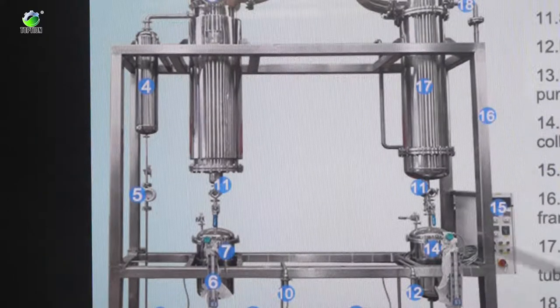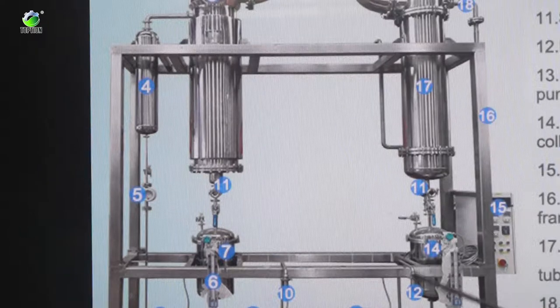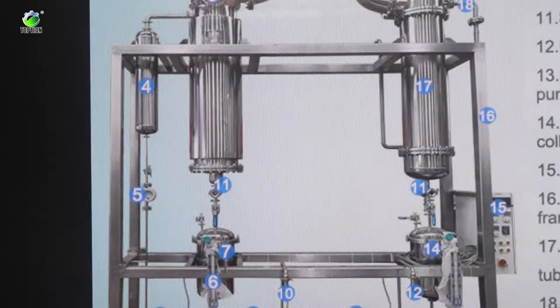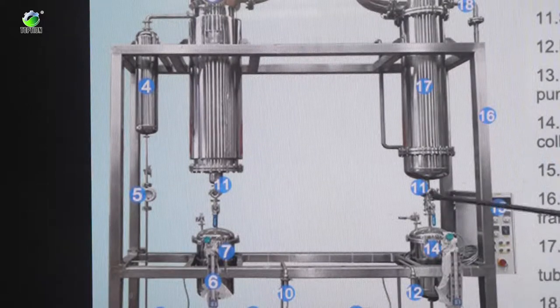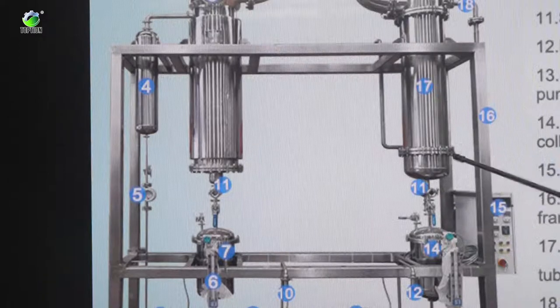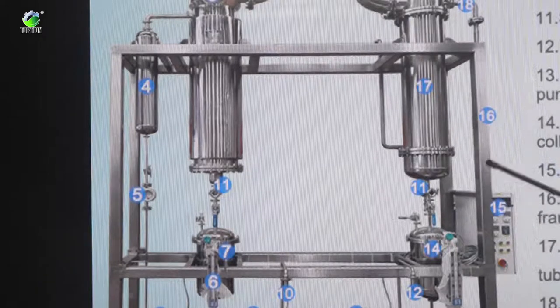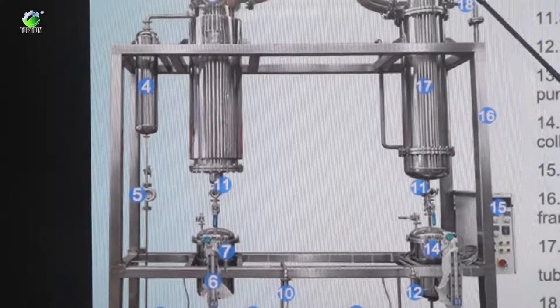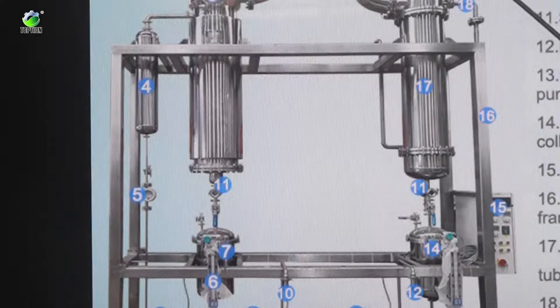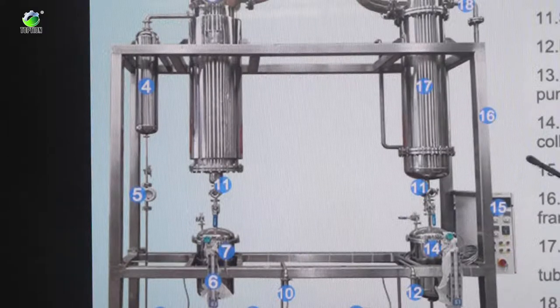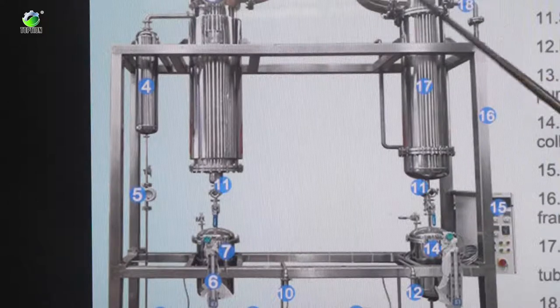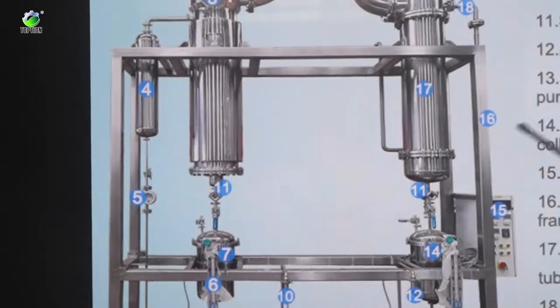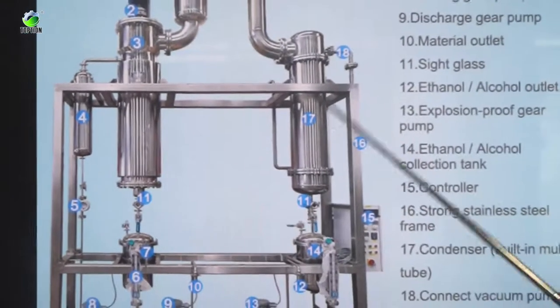And this one, the frame is strong stainless steel frame to support all this system. And the seventeeth, this large part is the condenser. With condenser there are many built-in tubes. And the eighteenth is connected vacuum pump. Vacuum pump will be connected here. And the last one is here. This is built-in stainless steel wire packing here. This is the whole structure of wiped film evaporator.